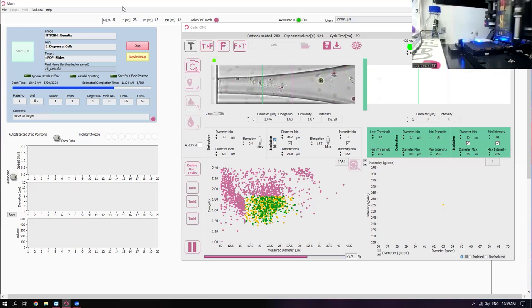I had a collaboration with PNNL where they developed the nanoPOTS, right? And I would say like 3 years ago, we decided we wanted to do this multiomics from the same single cell. And the gentleman there, there are a lot of really great people in this space. He's certainly one of them. And so we developed this nanosplits process, which will get published sometime soon. Some really interesting data there.